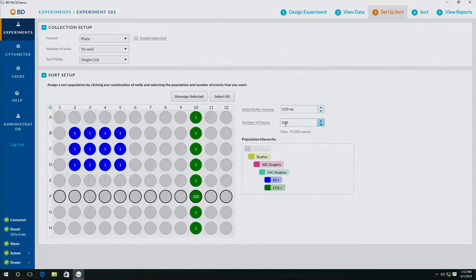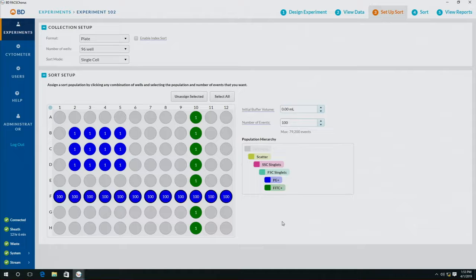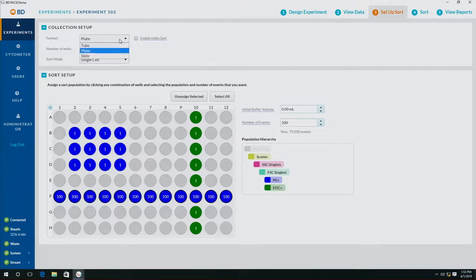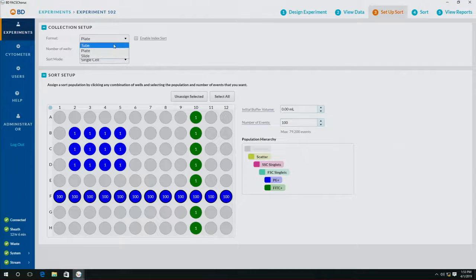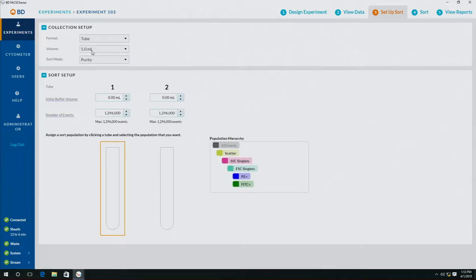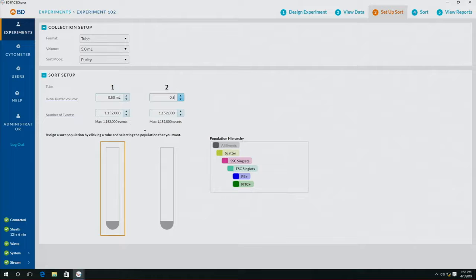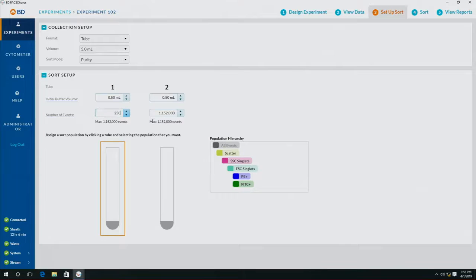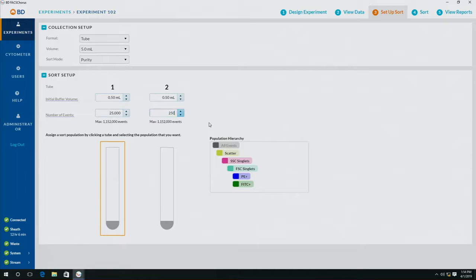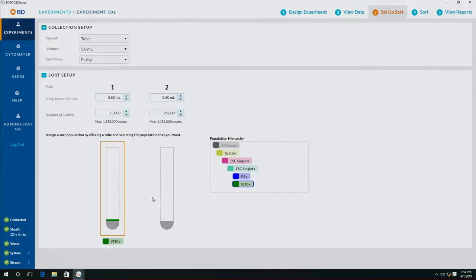For now we're going to sort into a tube, so we're going to select 5ml tube on purity, and I'm going to add how much buffer I am putting into each tube. This number here is the maximum number of cells I can sort without the tube overflowing. I'm actually going to sort 25,000 beads in each tube, and I'm going to sort the Fitzy positive on the left and the PE positive on the right.